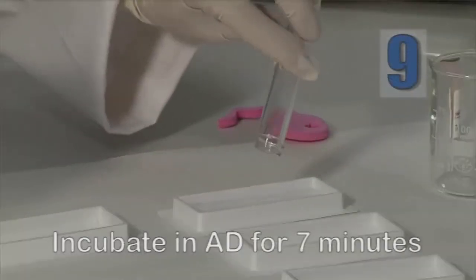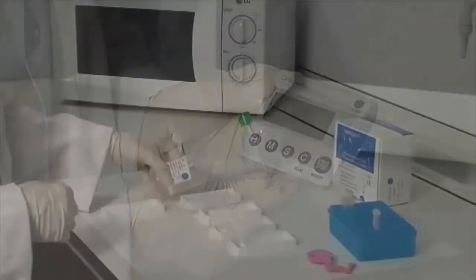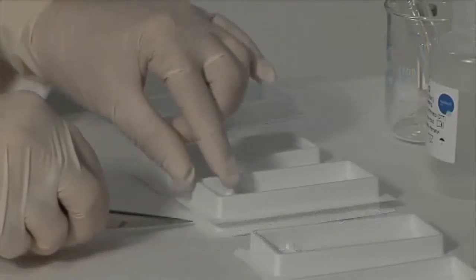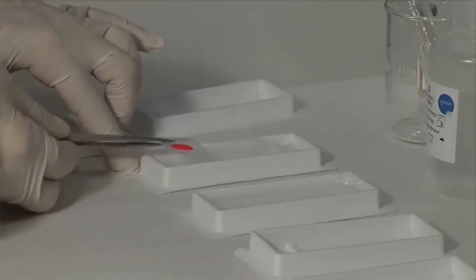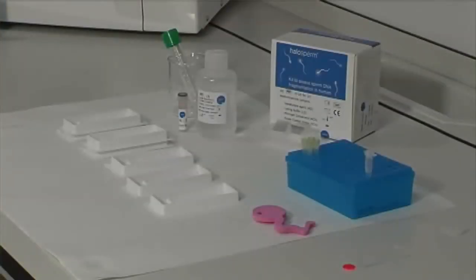Incubate the slide in the denaturing solution during 7 minutes at room temperature. Always maintain the slide in a horizontal position. Remove the slide from the AD solution using forceps and place it in lysis solution for 25 minutes. The lysis solution removes most of the nuclear proteins giving rise to the chromatin dispersion halos that determine the amount of fragmentation that the DNA has incurred.